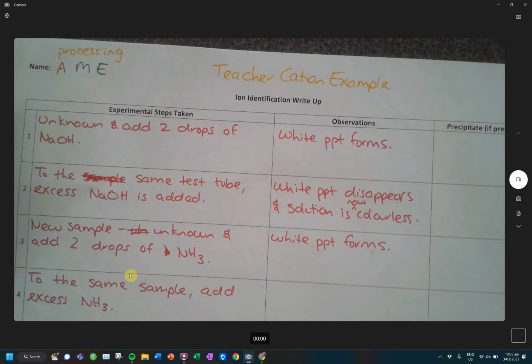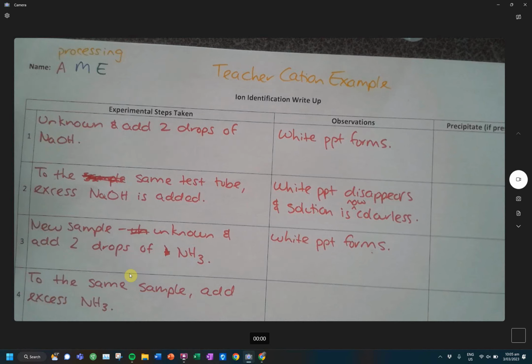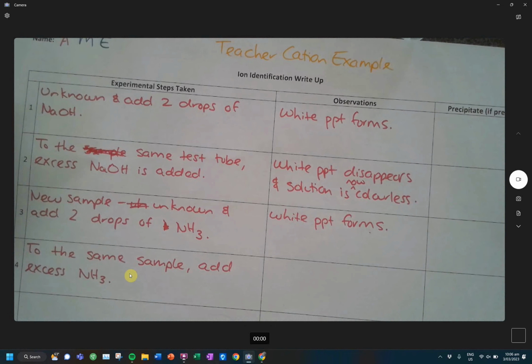So I'm just going to take a little bit of that out of my test tube, if I can get it out. Okay, that's annoying. Let's try to get it into this test tube. Just going to pour it now, I guess. There we go. So I got a little bit less in here now. Again, I'm just testing out to see if I get the ratios right. So getting some more ammonia in there, and we see that it's still not getting rid of it. So I'm very confident in this case that it's not dissolving. So I would say the precipitate remains.